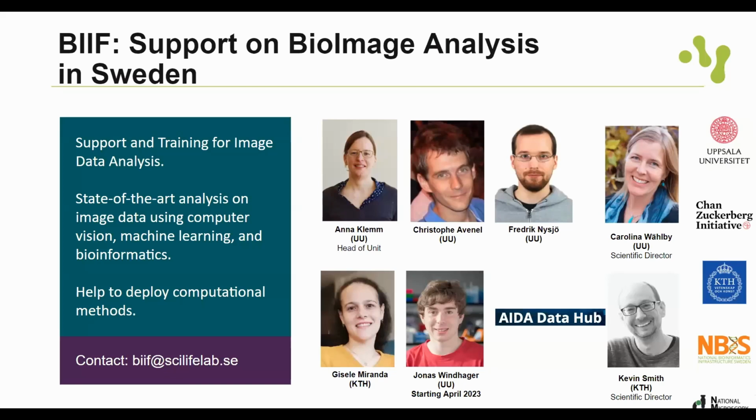And we start with a few slides introducing the Bioimage Informatics facility, so us, and then basically Christoph will take over and present TissUUmaps, for what you are here for. So let me share my screen. And then, do you see that well, I hope? Good. Yeah, thanks a lot.